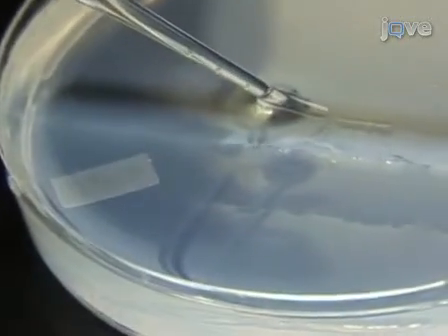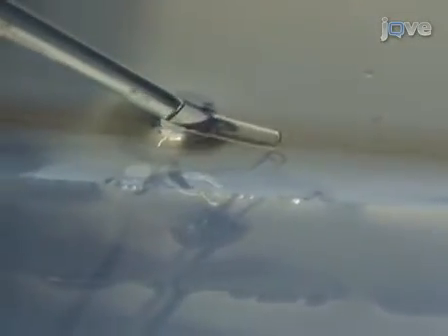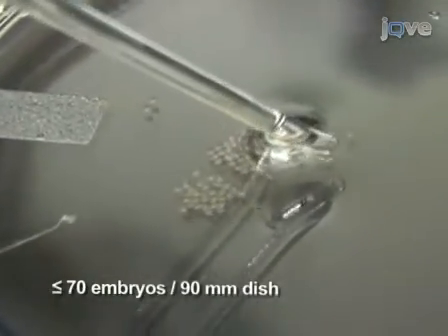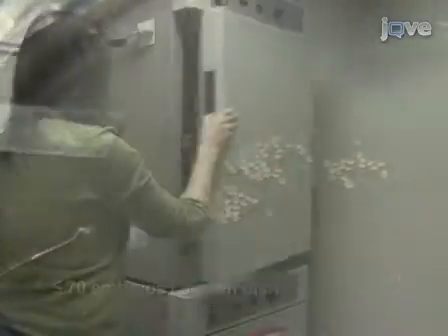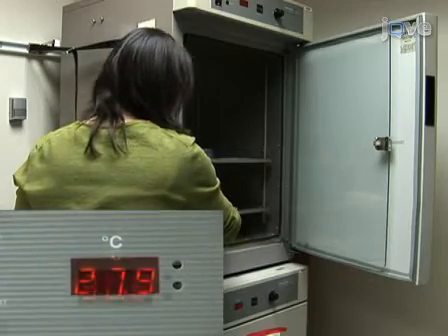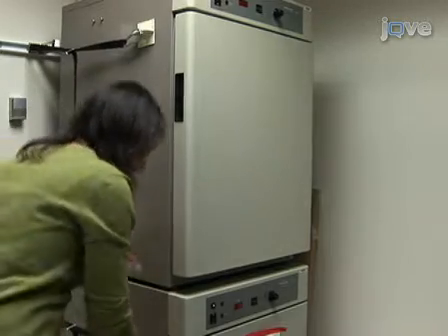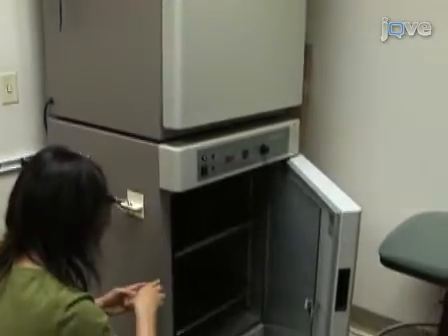Raise the injected embryos at low density in an agar-coated petri dish filled with fresh pen strep embryo medium. Note that injected embryos tend to have a slightly slowed rate of development. Incubate embryos at different temperatures, 25, 28, and 31 degrees Celsius, to stagger their development and maximize the time window over which transplants can be performed.